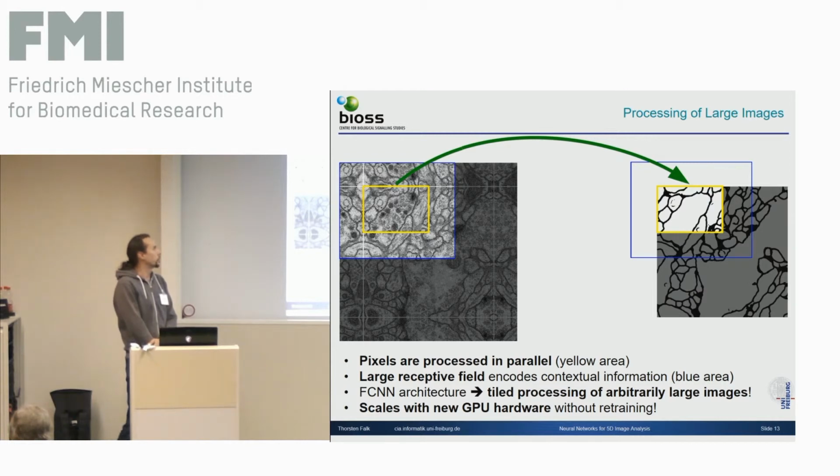It's only a matter of how many samples or how much time, how many tiles you have to process in the end. And you can easily parallelize it per tile. So if you have a cluster at hand, no problem. Just throw all the tiles on different cluster nodes and you have them back immediately, more or less. Right, so that's the cool thing about it.